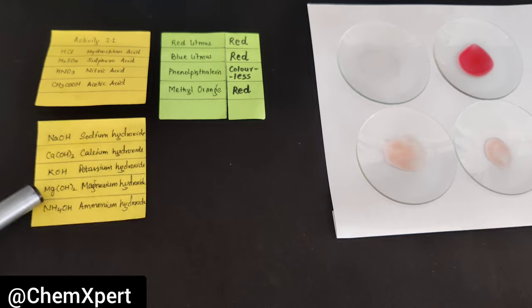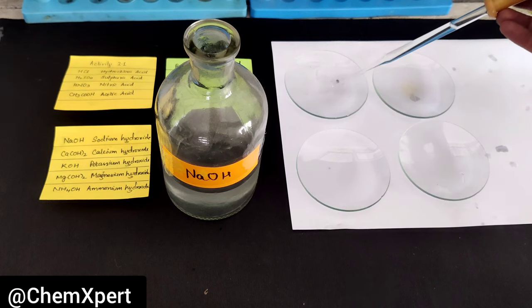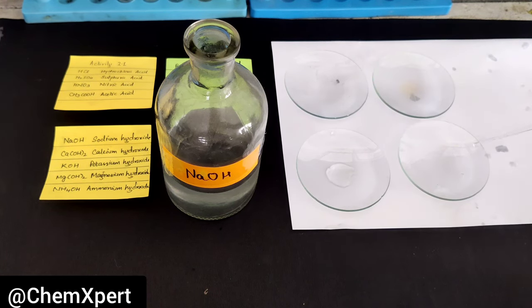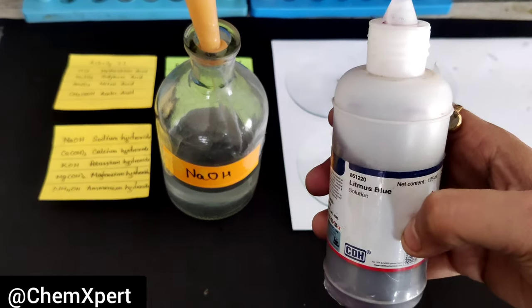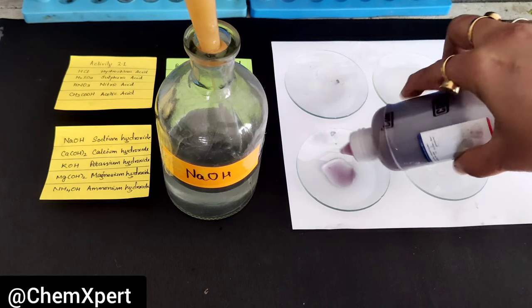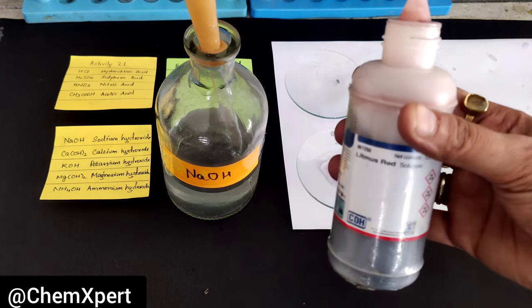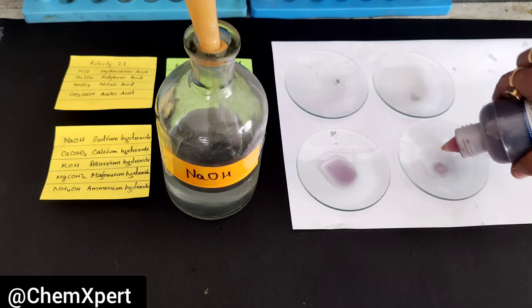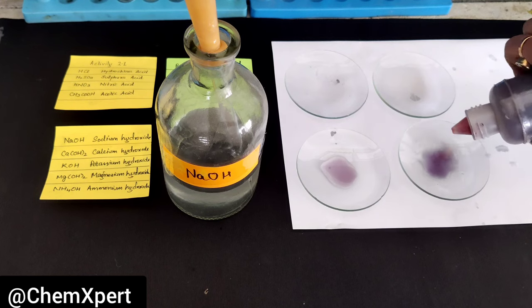So now we move ahead for the bases. The next step is to add base on the watch glasses. I have washed the watch glasses and now I am adding NaOH. I add blue litmus indicator — since it is a base, blue remains blue. Similarly, red litmus changes into blue in color when it touches the base solution.